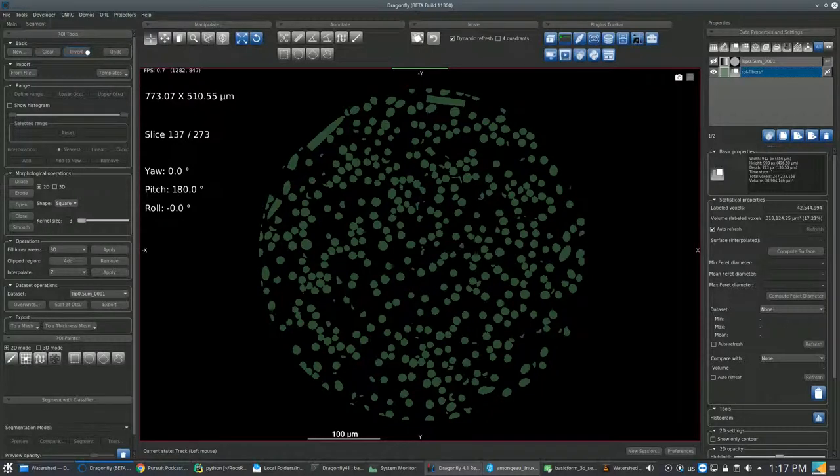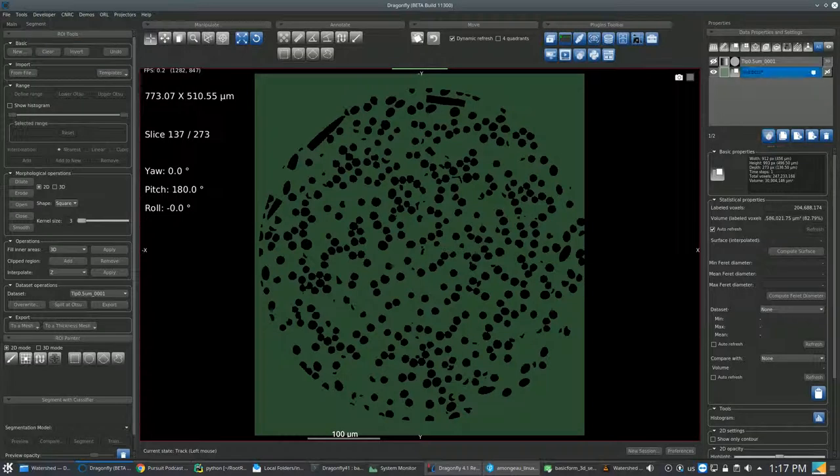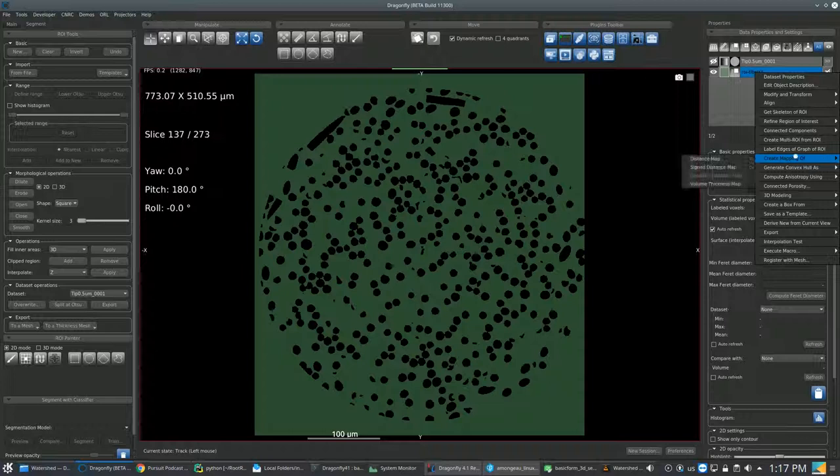Next, you go back to your objects and right-click on your ROI to create a mapping in which you click on Distance Map menu item.